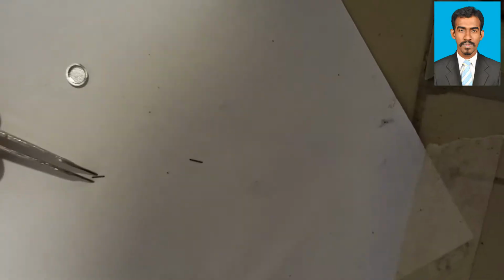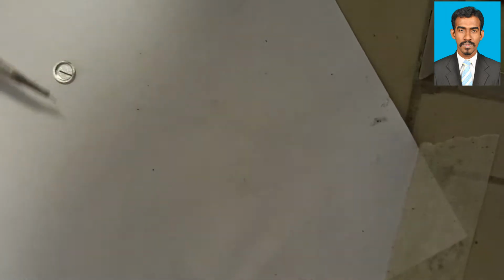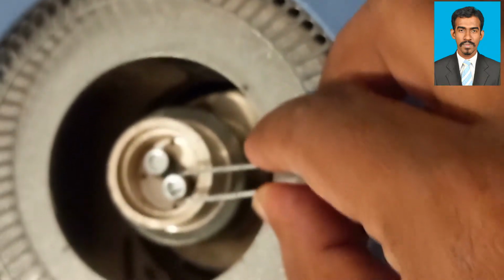The length of this specimen is 2 mm to 3 mm. The wire should touch the bottom of the pan. So I put on the specimen.